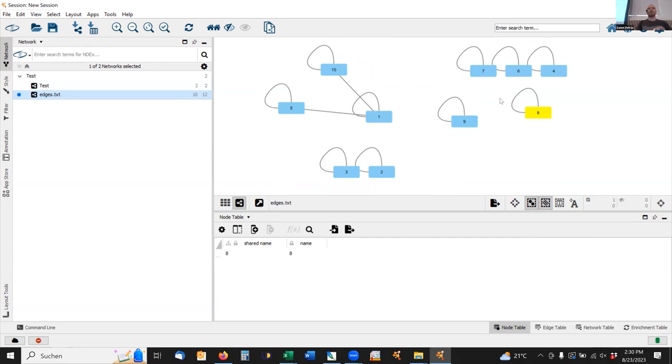I can load in MS2LDA substructure information from Justin tomorrow. So I can stagger these networks. And this is really powerful because it opens up data integration to whatever. So if de novo annotation becomes a thing, then maybe next year you can load in MS Novelist, and so on.